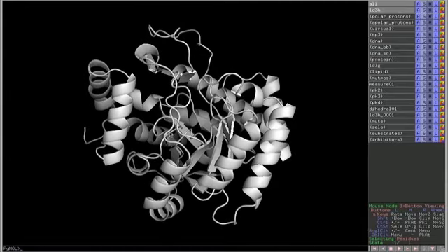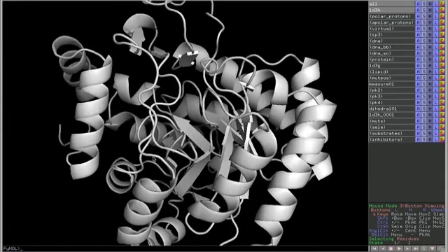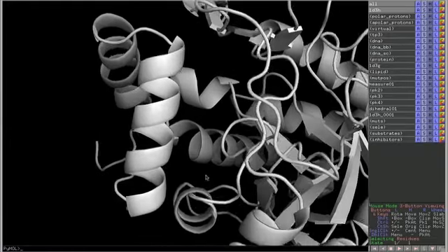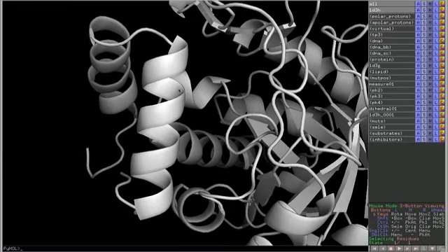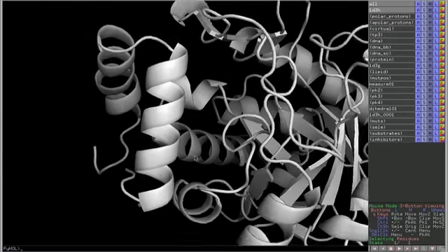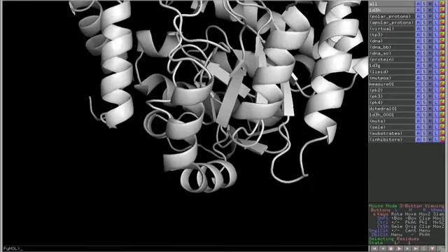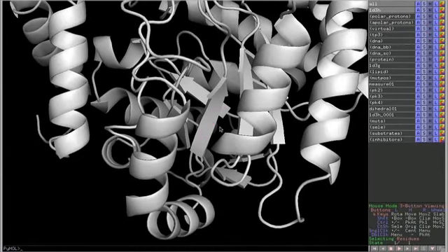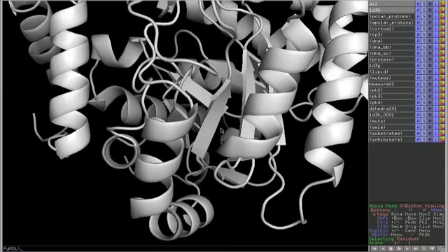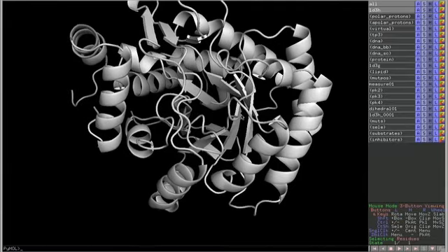And when you look at protein structures after they've solved the first 5 or 10, they realized that there were certain recurring patterns that they saw over and over again. And you can see them here. These patterns are called secondary structure, the secondary structure of proteins. And here's one which is called an alpha helix, this little helical structure here. You can see a lot of our protein is made up of alpha helices. And then there are also these little arrows in here, which are beta strands. These are just different ways that the protein backbone likes to fold up in space as it travels through space. And they give coherence and some sort of order to the overall structure.